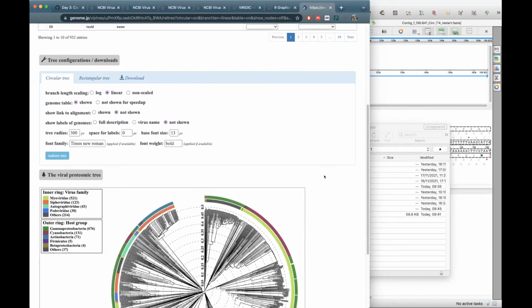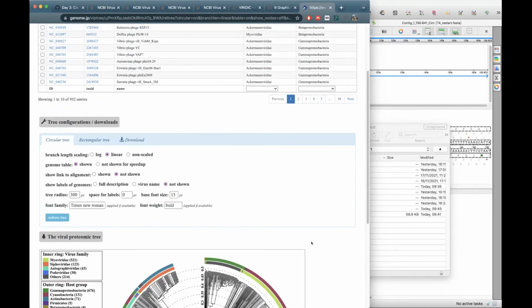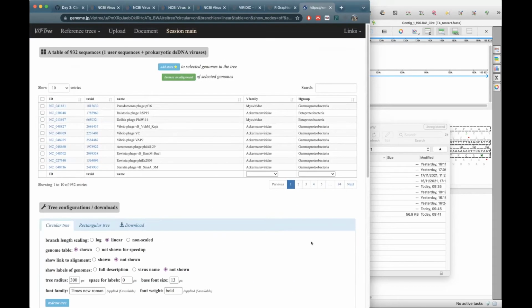Okay, so basically, if my hit here is now matching from that upper table the option 157, then I copy that 157 option and I BLAST it to see what more information I get about it.